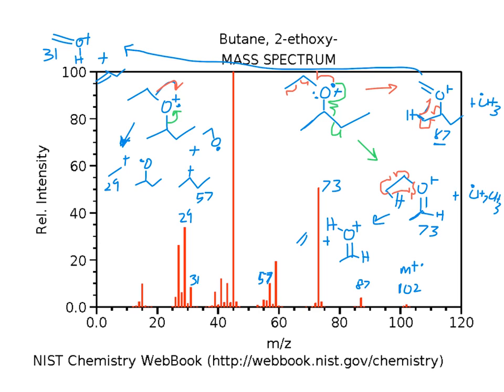And I believe that this one is at 45. So this apparently, and I'm not quite sure why, if this is how it's formed, this kind of double cleavage is the base peak.